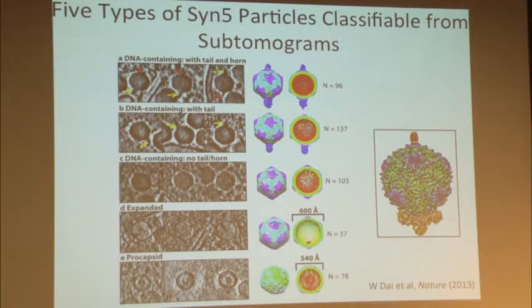And then secondly, we see this particular density here. We interpret it as a terminase, because when the DNA is encapsulated, it needs energy. So these terminases actually provide energy. Again, this is very transient. When the DNA is packaged, this enzyme will disappear. We've never been able to capture a state like this.